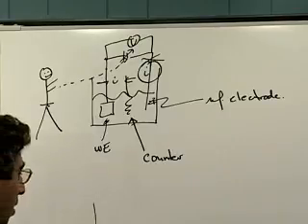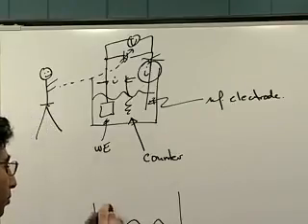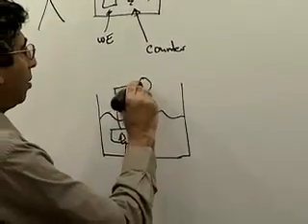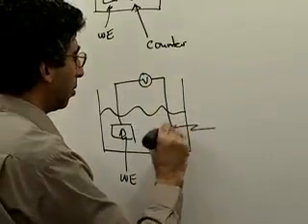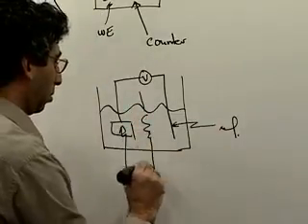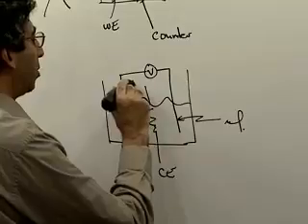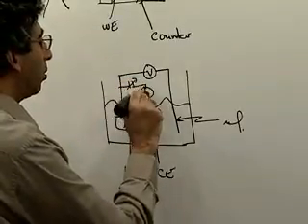We'll leave the undergraduate out now. He's still there, but so we're going to have a voltmeter between our working and reference. We're going to have our power supply, variable power supply now, between our working and counter electrode, and we're going to monitor the current flow there.